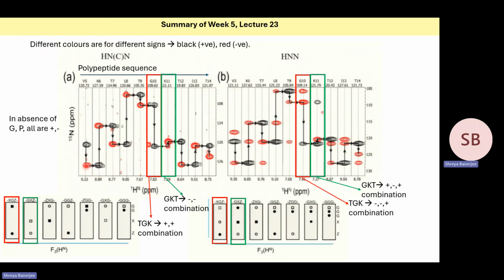The cross peak means the interaction of valine with the peak of lysine. So this is the peak of lysine, and you can now move to lysine. You get the self peak of lysine, then you can move to the cross peak of lysine. Like this, you can travel through the polypeptide sequence. Each amino acid will have two peaks with different signs. The self peak is positive, the cross peak is negative.